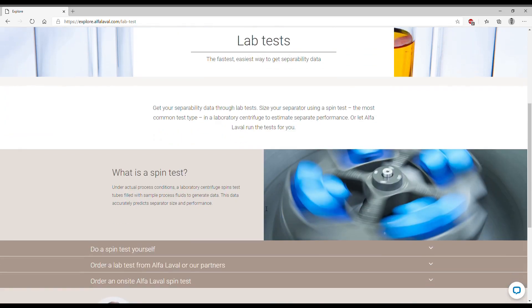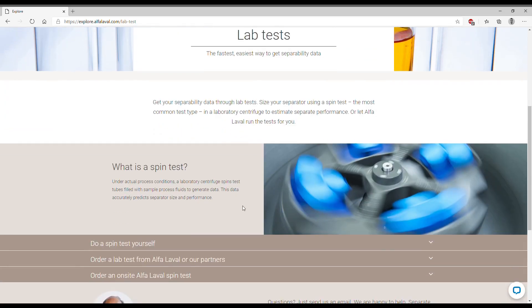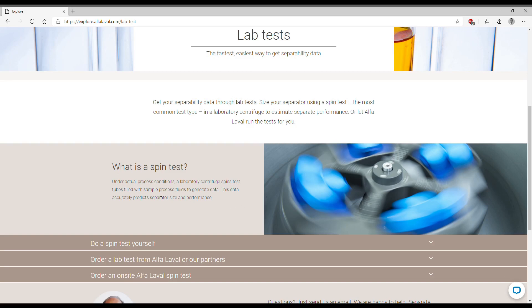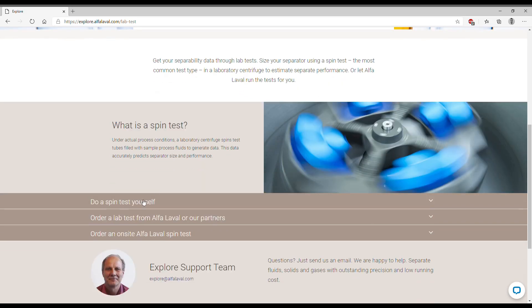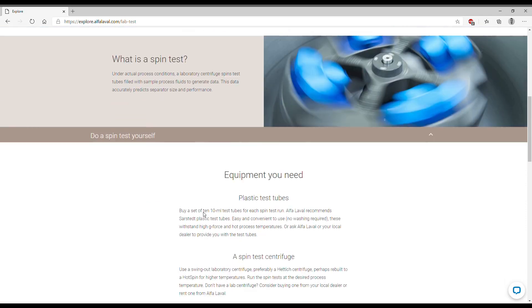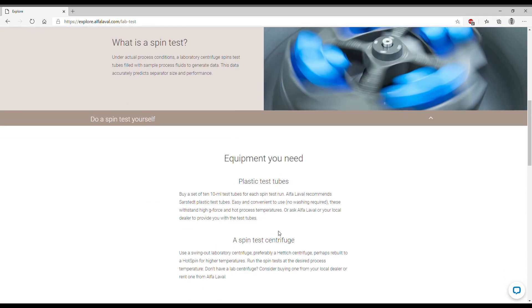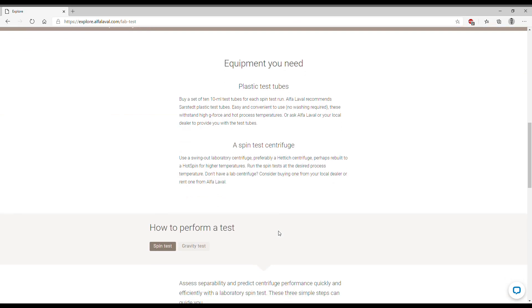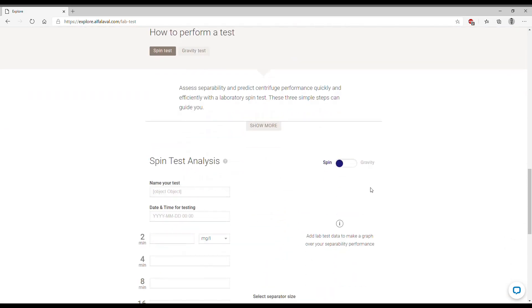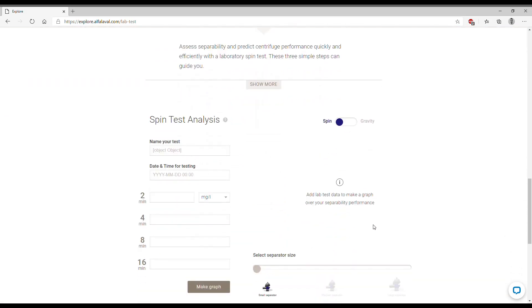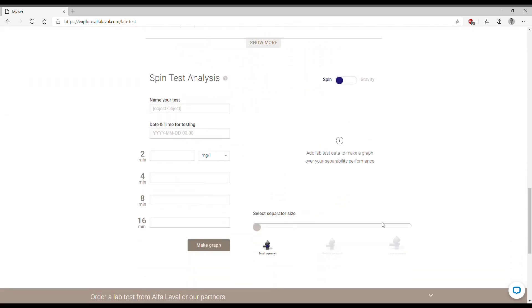We will be assuming that you will be the one doing the lab spin test at your facilities as they are quite quick, convenient and easy. So we will be opening this sub page. It starts at first describing what equipment you need but we will focus on the second part of the page which is the actual scale up tool.